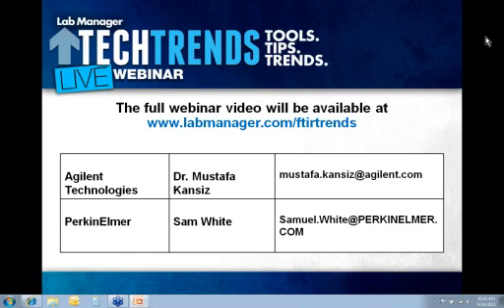Plus, you do lose that information if it goes into solution sometimes. Yeah, correct. I'd agree. I think anything in solution, if it's particularly low concentration, quantification is generally okay, but extracting structural information, because the bands are so broadened, makes for subtle structural elucidation difficult. But without actually seeing the samples and measuring them, we can't be certain either way.